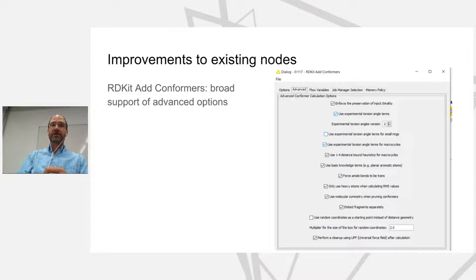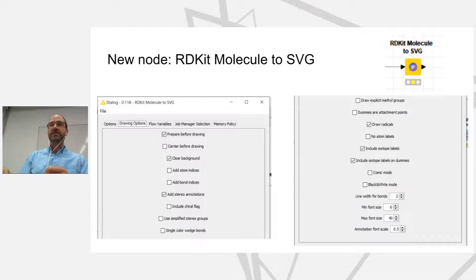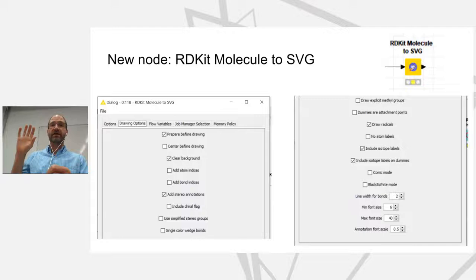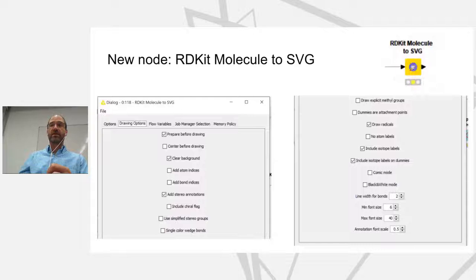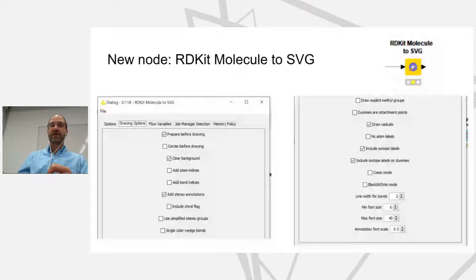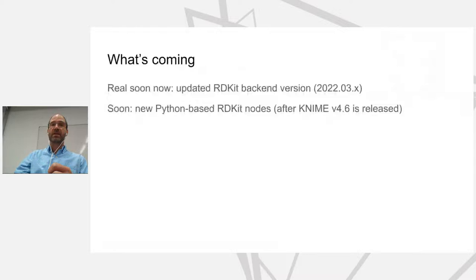The new node we've added over the past year is the Molecule to SVG node. This is particularly useful if you have molecules in a KNIME table and want to make those visible in views — for example in a table view or tile view. People familiar with KNIME are probably used to the Render to Image node, but it's kind of slow and doesn't give much control over how molecules are drawn. The new Molecule to SVG node gives access to a lot of control over molecule drawing in RDKit and directly outputs an SVG cell — it's also a lot faster.